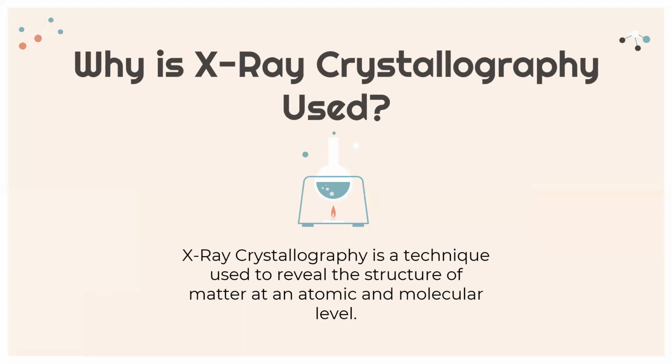So first, I'll be presenting general information about this instrument. So why is X-ray crystallography used? This is a technique that reveals the structure of matter at the atomic level, and in order to do this, scientists need to obtain a crystal to expose to X-rays, and then use a pattern of X-rays as they pass through the crystal to calculate the molecular structure. The crystals scientists produce need to have certain characteristics to ensure high-quality results.